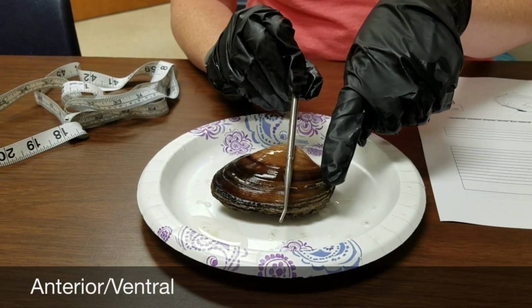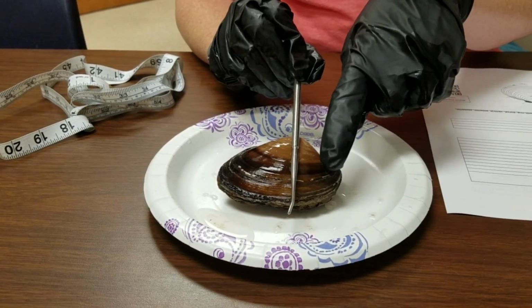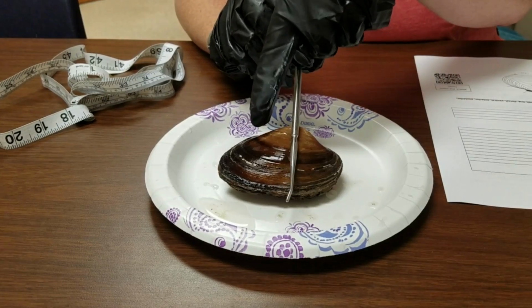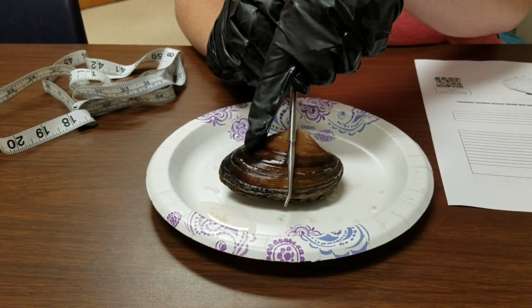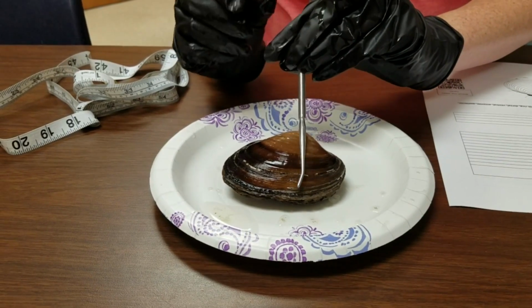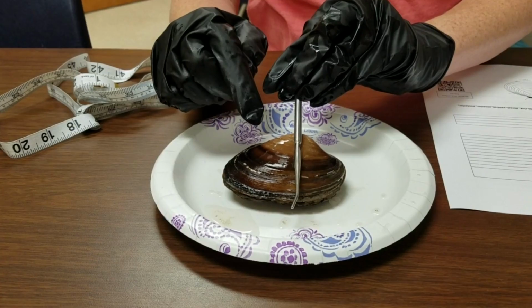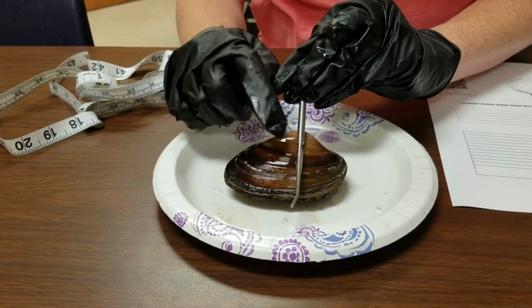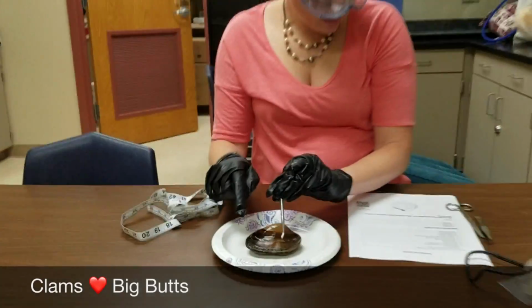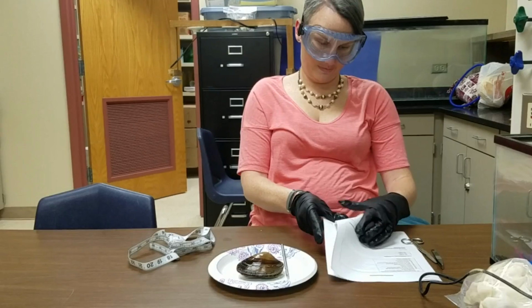All right? So posterior, the way that I always remember this is that your posterior side has your butt on it, and the clams, apparently, they like big butts and they cannot lie. That is your posterior side, okay? And yes, feel free to use that with your friends and family now because they're going to think you're super smart in aquatics. So posterior, the butt side is the big side. Clams have big butts. Okay, and then the other side is anterior. All right.